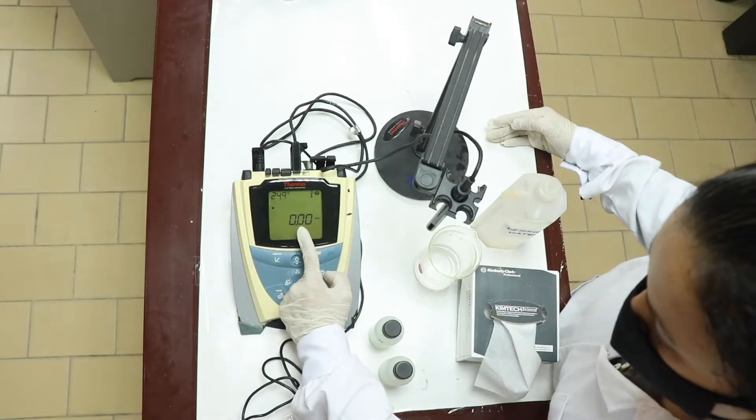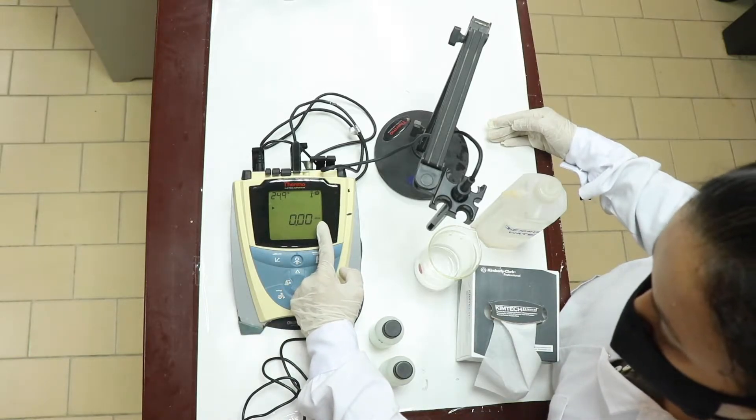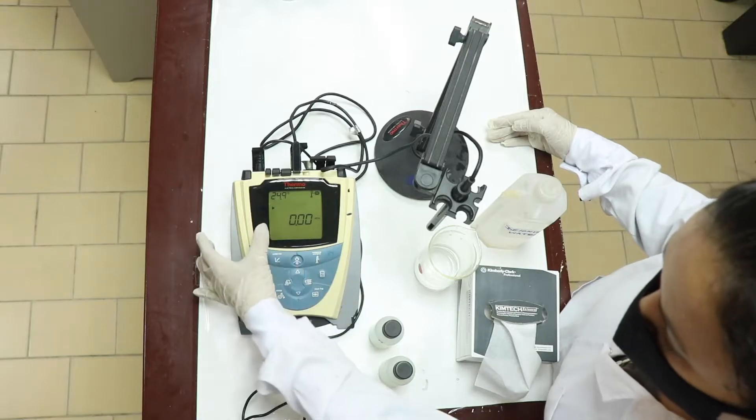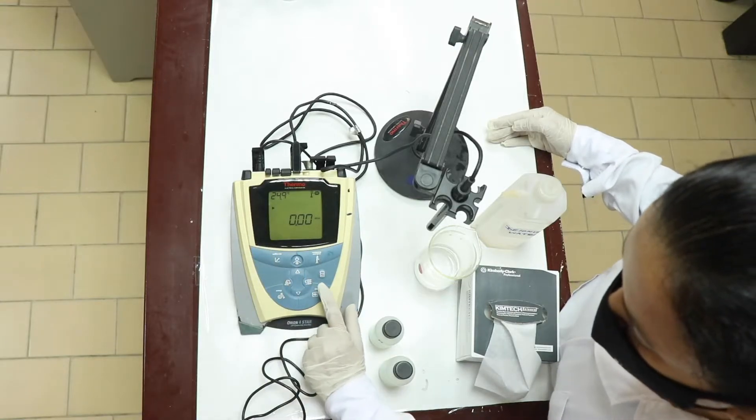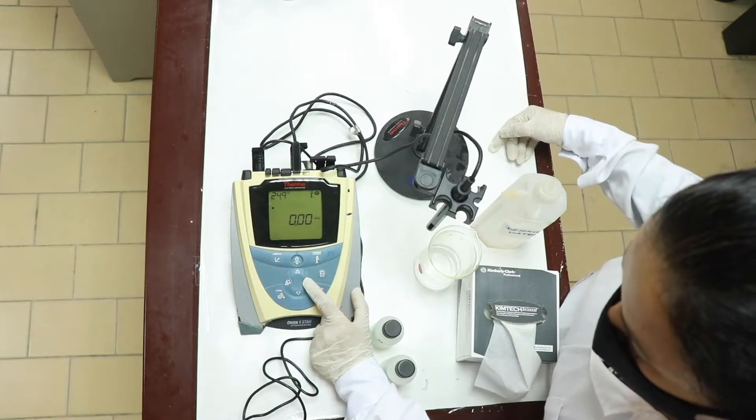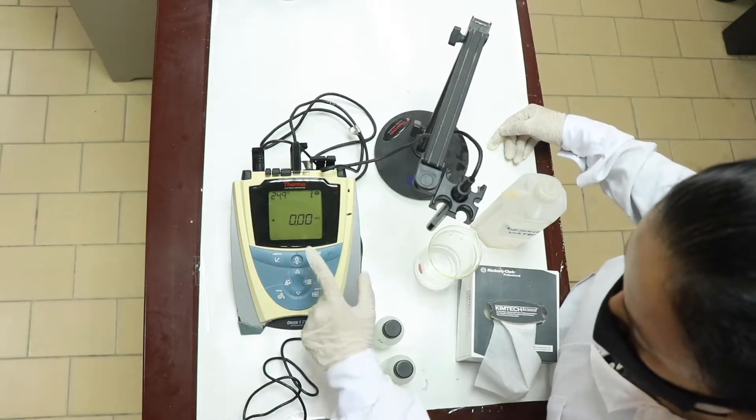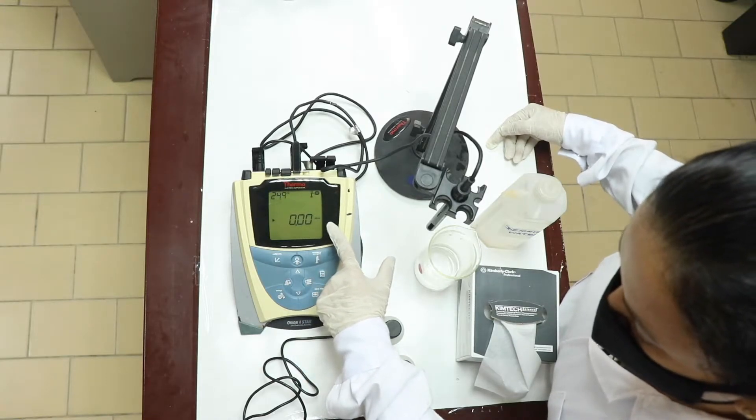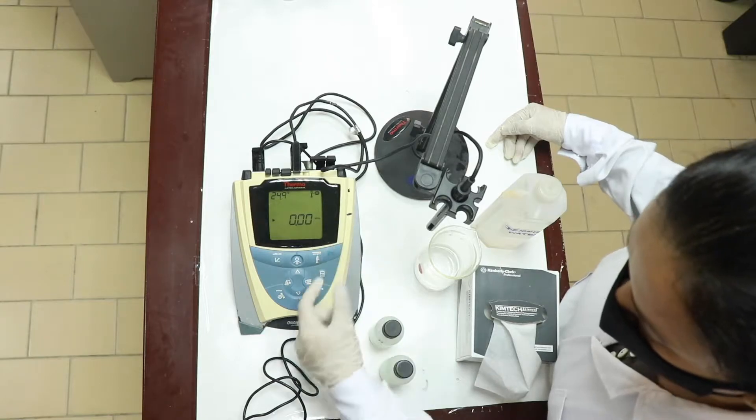Now, you can see 0.00 microcms per centimeter is here but the cursor is up. Using this key, you have to bring the cursor down. If it is now against microcms per centimeter, that means it is ready to read the conductivity.